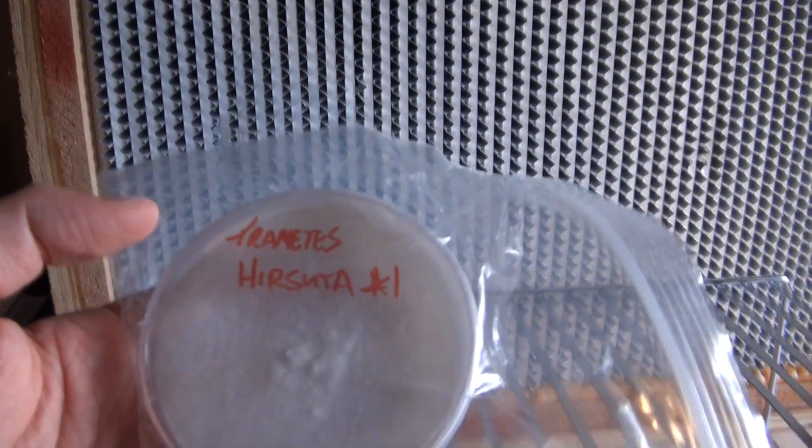Of course, if you're cloning wild mushrooms, your rates of contamination are likely to be much higher. It'll probably take a few more transfers to get a pure culture. And even then, you won't be sure how well it's going to grow out or how well it's going to perform until you try to fruit it.